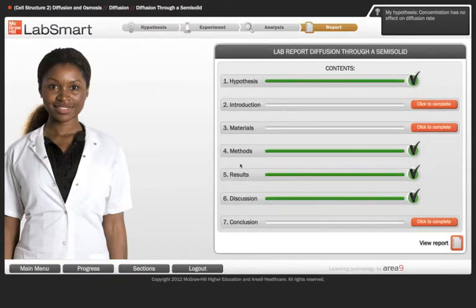And then I move on to this pre-report, and this shows me where I've got some problems and I need to go back. And so if I've got everything filled in green, then I've done okay. And where I've made errors, for example, I didn't use the appropriate materials. I said I would do one thing and I did something different, so I need to remediate on my use of my materials. I can go back into the simulator and I can make those corrections, or I can possibly answer some questions which would show that I understood the errors I made.